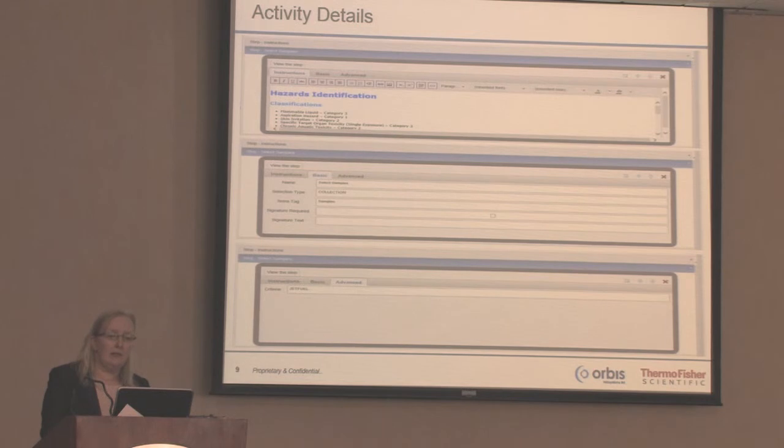So these are your activity details. This will decide what you want displayed on the screen and how you want it displayed, and what instructions you're giving to the analyst.